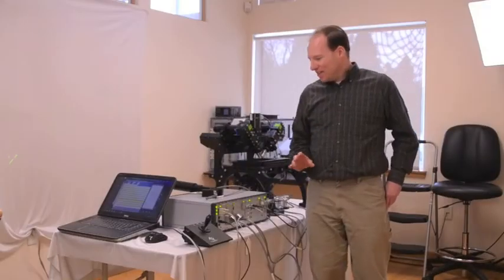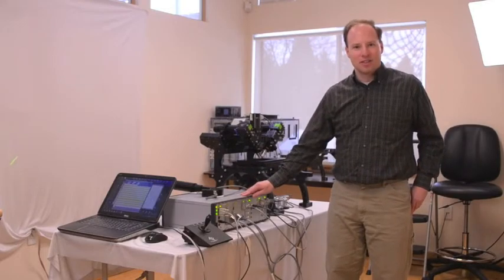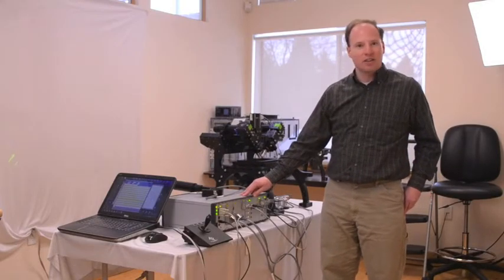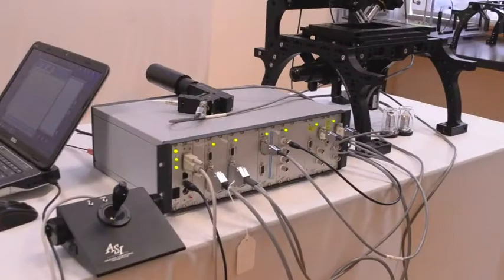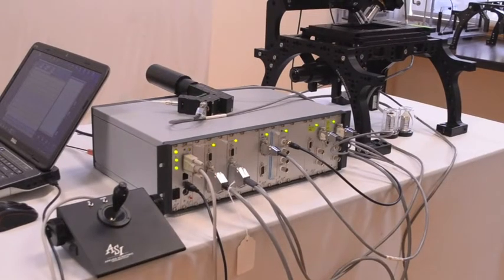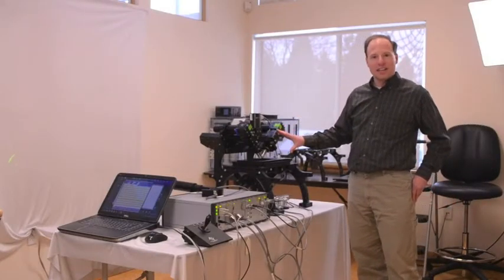So I'm now going to tell you a little bit about our modular controller. This is called our Tiger or TG-1000 controller. And it's needed for the DI SPIM system because there's simply so many things to control. In the DI SPIM system there's a total of ten axes.